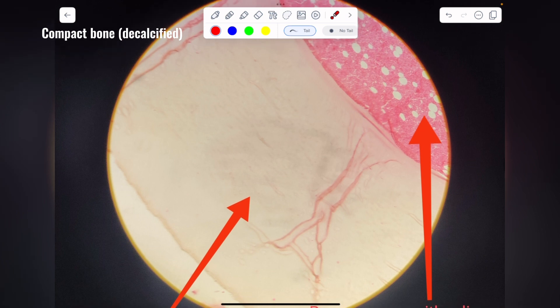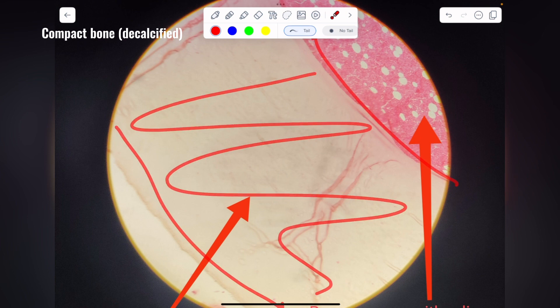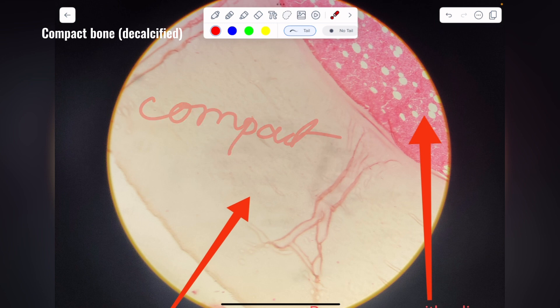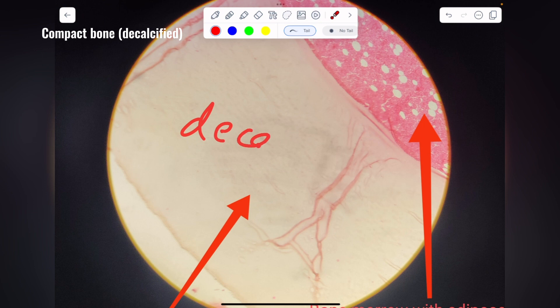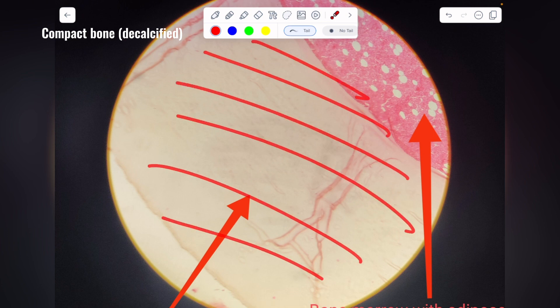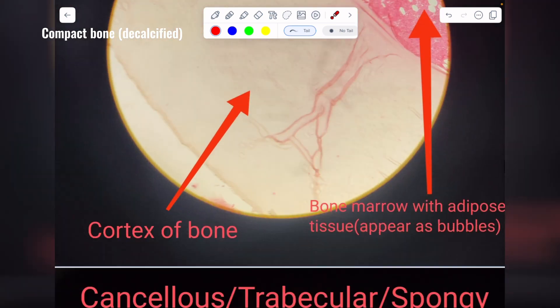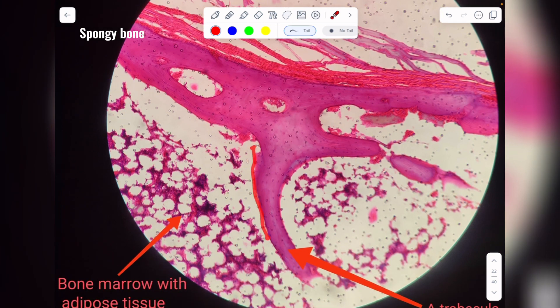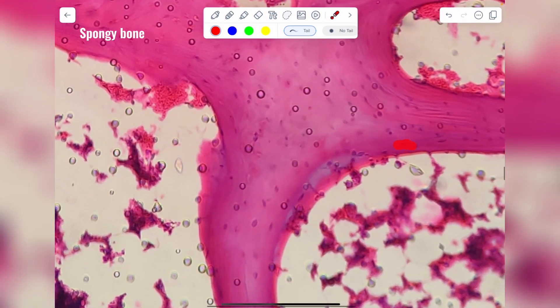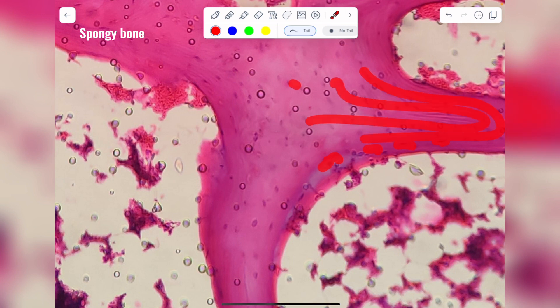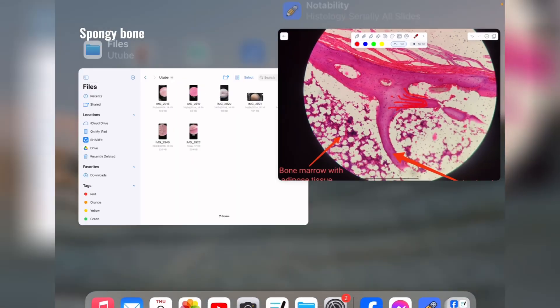Now looking at bone slides: here is bone marrow containing adipocytes, and this is the compact bone. However, you cannot see the Haversian system because this bone is decalcified — since it is decalcified, there is no lamellar deposition of calcium, which is why it appears smooth or plain. This is your decalcified bone. This other structure is the trabeculae of spongy bone, inside which osteocytes are arranged in lamella.